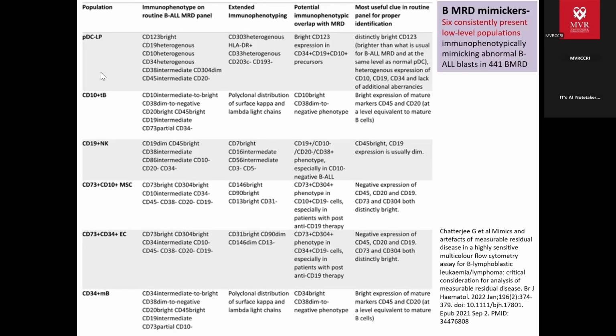And below that we will have the limit of detection of our lab and limit of quantification, that is 14 and 50, and then we'll put it in the percentage. So it will be 10 divided by 14 divided by the number of events that have been acquired. If it is 1 lakh or 1 million, the percentage will vary. So please do see what was the LOD, LOQ percentage of that particular assay of this MRD report. Then we will be mentioning the dilution parameters, which will help us to assess whether our sample was dilute, and then some disclaimers.